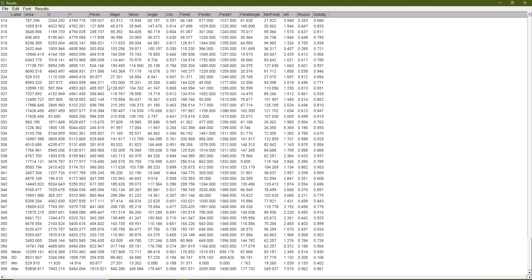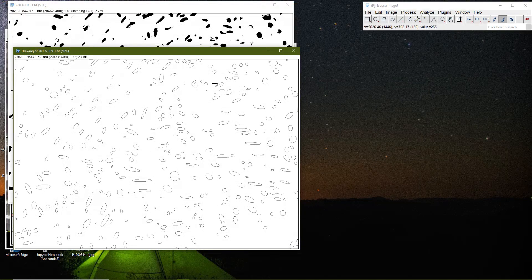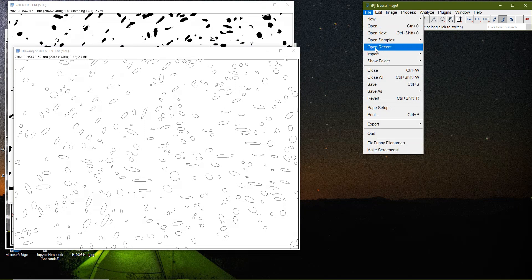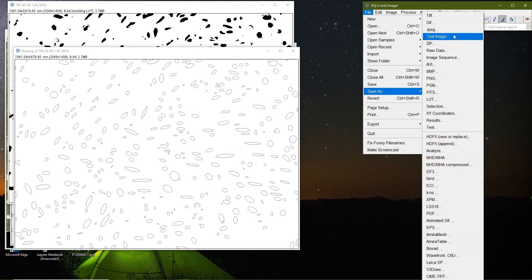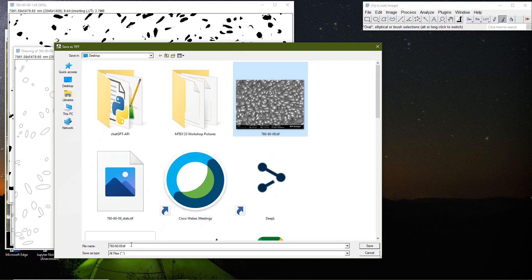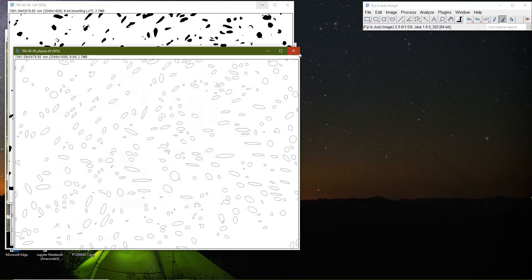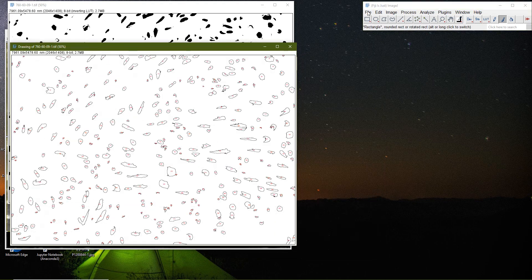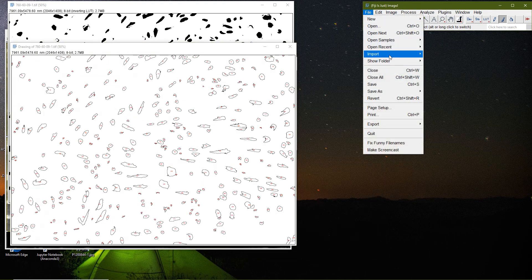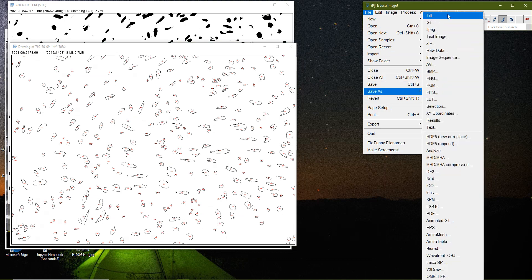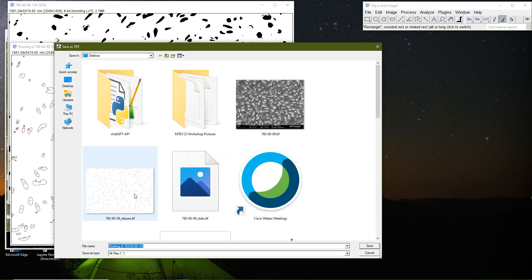It saves as a CSV file. I also want to save the image files: File > Save As > TIFF. I select the image and rename it — for example, 'ellipses' — then save as TIFF.